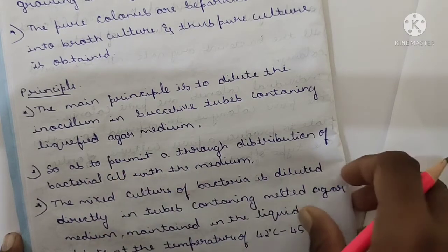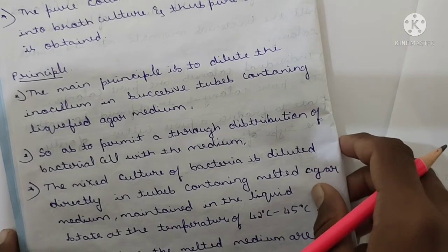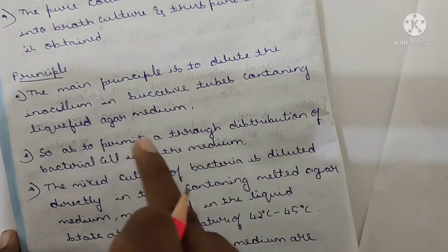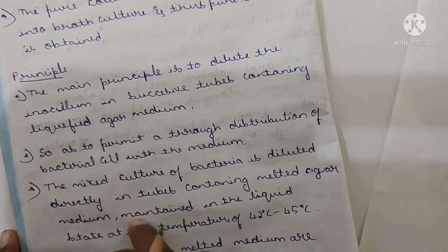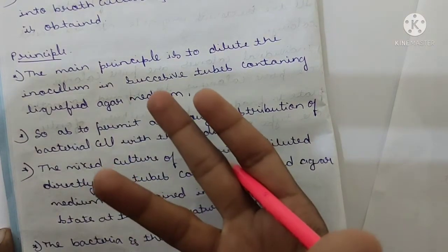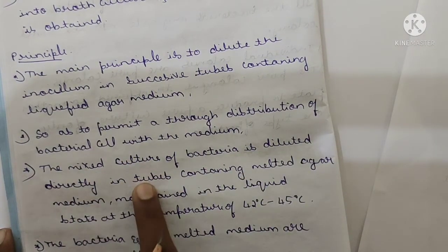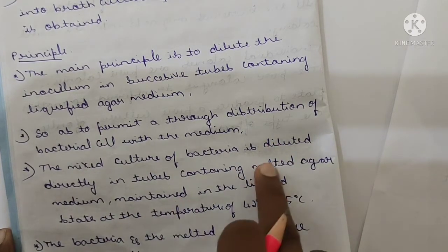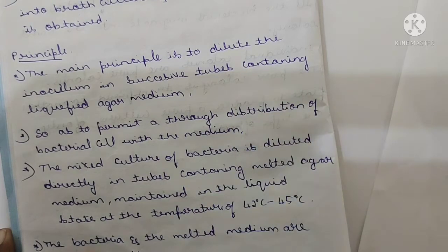So as to permit thorough distribution of the bacterial cells within the medium, we are distributing the inoculum throughout. How? By diluting the mixed culture of the bacteria. The inoculum is diluted directly in tubes containing melted agar medium, maintained in the liquid state at a temperature of 42 to 45 degrees Celsius.